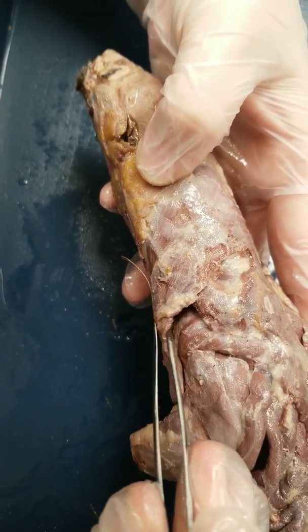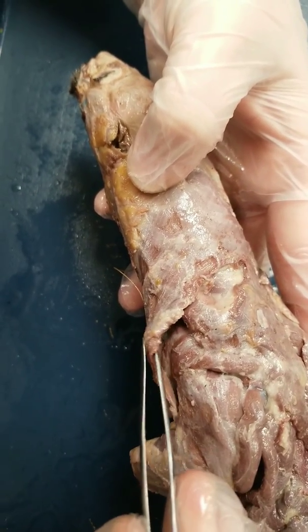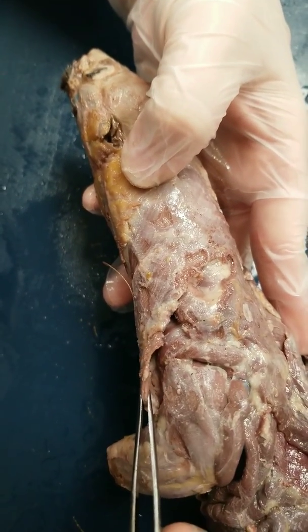This muscle is the clavodeltoid muscle. It goes over the shoulder — it's kind of like a cap, similar to our deltoid muscle in the human. This is the clavodeltoid muscle.